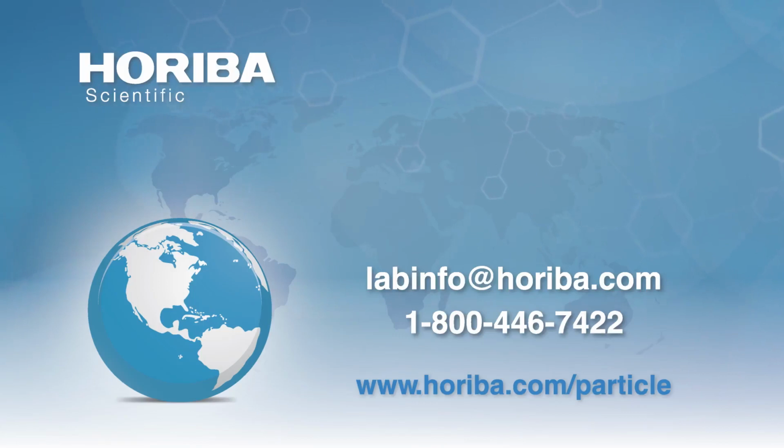I have a question that came in. May I go ahead and read the question to you? Okay. Yeah. So this came from the registration. So do polymer molecules have zeta potential?